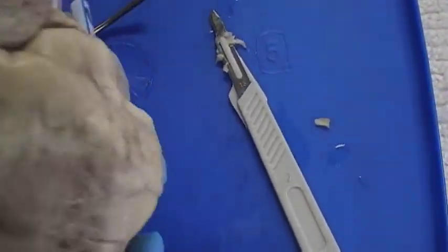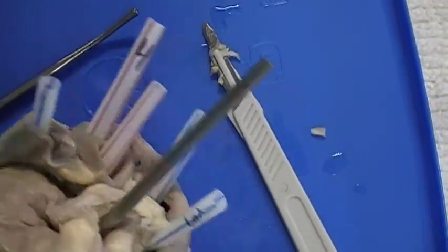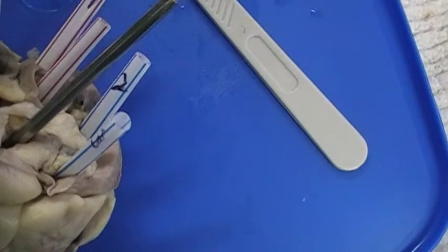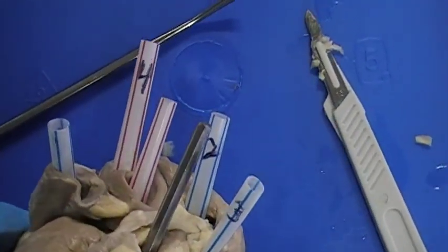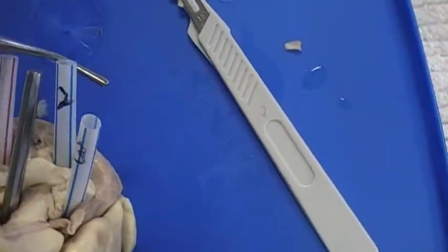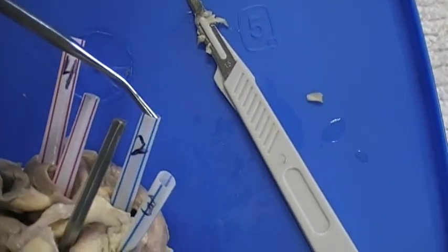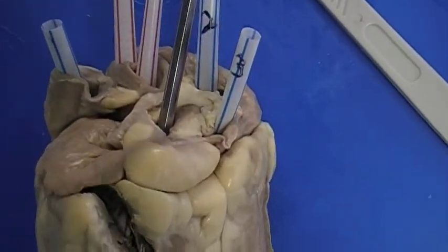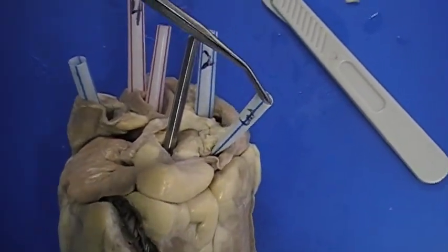is, turn this guy over, you can kind of see him. He's the number 2 rod. See if I can push this guy down a little bit more. He is the number 2 straw right here. And he goes into the right atrium. The inferior is the number 3 right here. And he goes into the right atrium.